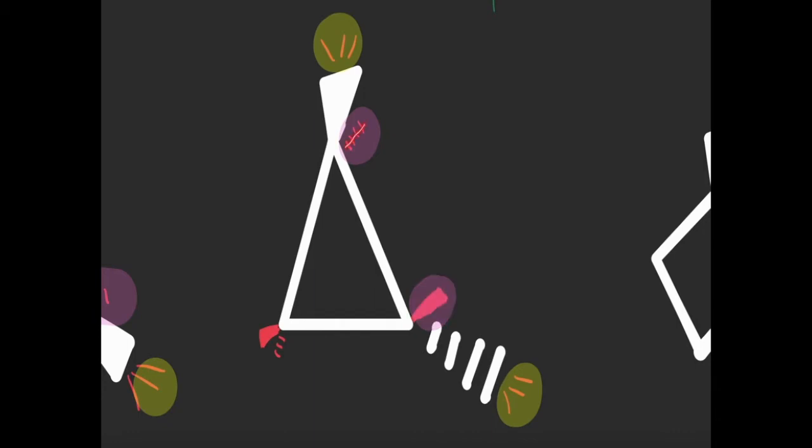So this hydrogen is attached to a carbon, which is attached to a methyl group. This hydrogen is attached to a carbon, which is attached to a methyl group. And if you go this way, you see the same thing, and if you go that way, you see the same thing, and this way they see each other. So they're equivalent. But what about this signal right here? So we see a wedge up hydrogen, which sees a wedge up methyl, and a wedge up hydrogen.